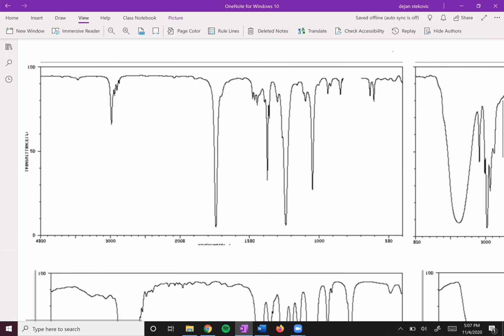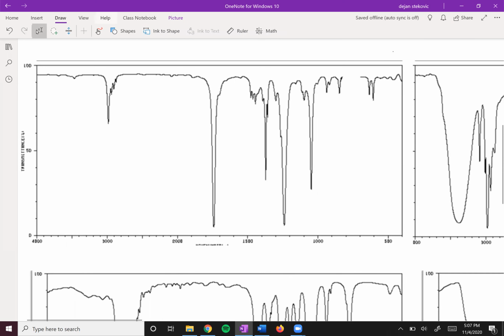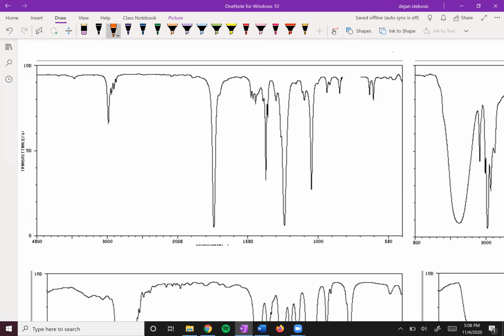But we're going to take a look at the spectra and see what they can tell us, right? So here we have this spectra right here. And we want to think about what it tells us, right? Here's 1500, so this line is 16, 17. So we've got a very strong peak around 1700. That's most likely going to be a carbonyl peak, right? This right here, those are our CHs, just our regular alkyl CHs.